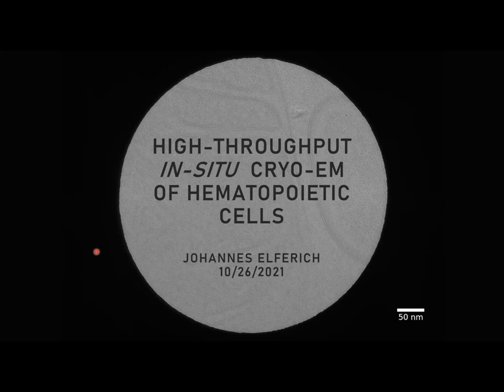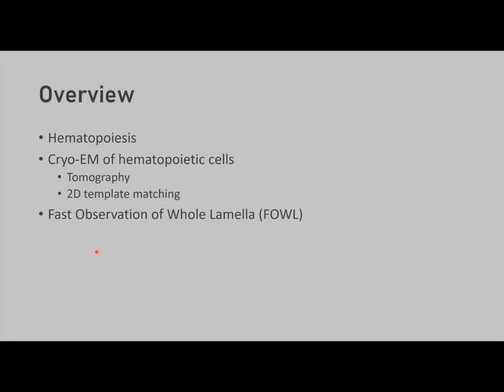All right, great. Thanks. Hi everybody. Thanks so much for giving me the chance to talk. And so what I want to talk about is some ideas we have how to image, in our case, hematopoietic cells with cryo-EM in a more high throughput fashion.